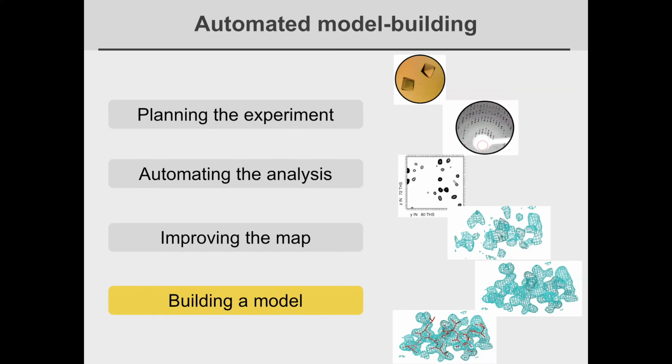So there's one more question that maybe we should try and answer. No worries. What are the values or parameters we need to see and confirm, I assume, that we have gotten a substructure solution in the Phenix log?